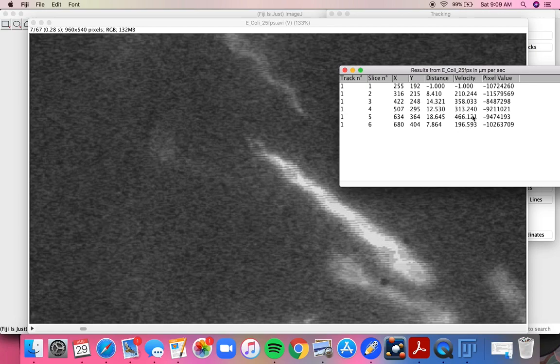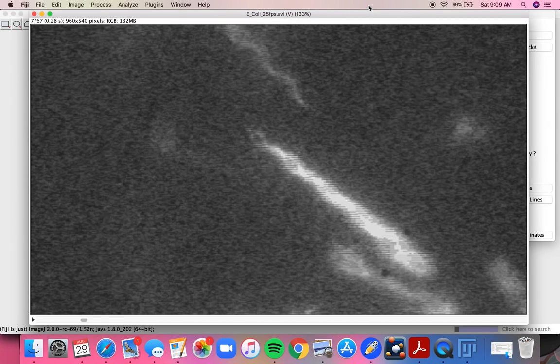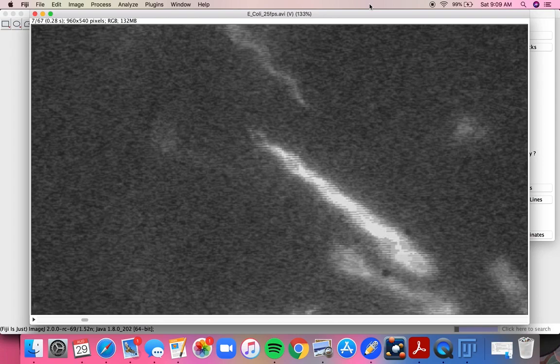Find an average velocity here, and you want to compare those velocities and then ask yourself this question: will this guy need antibiotics? I don't want to give away the ending, and I want you guys to think about how you might determine whether or not they might need antibiotics by comparing the velocities.